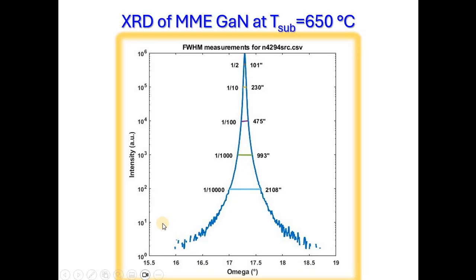There is only one condition. I have set the noise level at an intensity count of 10. So if the intensity count for any of these is above 10, then the program is going to calculate the value for me. Otherwise, if it is below 10, then the program assumes that this value is below the noise level and it's not going to give a full width value for that particular parameter, I would say.